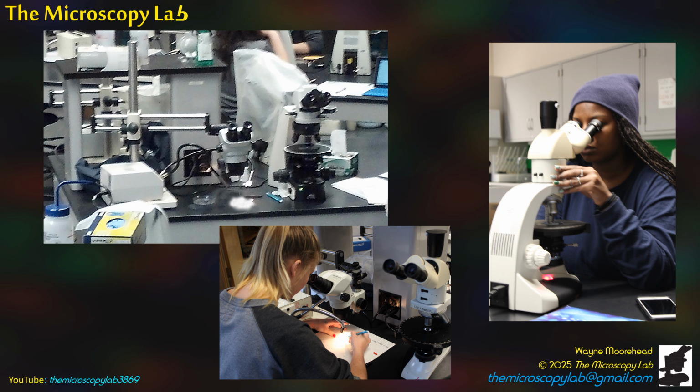When teaching forensic microscopy at a Tier 1 university, several students admitted to me several weeks after the first lab that when I told them they would be learning theory and operation of a stereo light microscope and a polarizing light microscope, with both microscopes sitting in front of each student, like you see here, they didn't know which microscope was a stereo microscope and which was the polarizing light microscope.